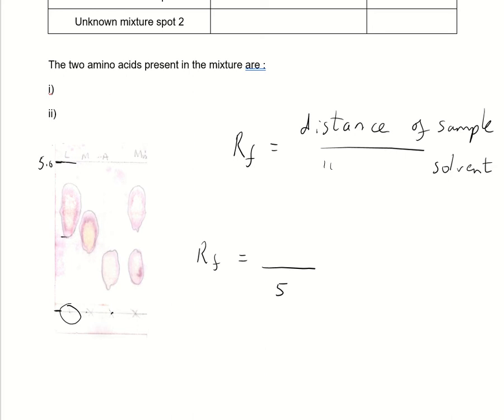So what I would do is record the bottom of that and the top of that, with where they've got up to. I'll just make up some numbers. We'll say that's 3.2 centimeters, and we'll say 4.6 centimeters up there. So I want to know where the middle is.